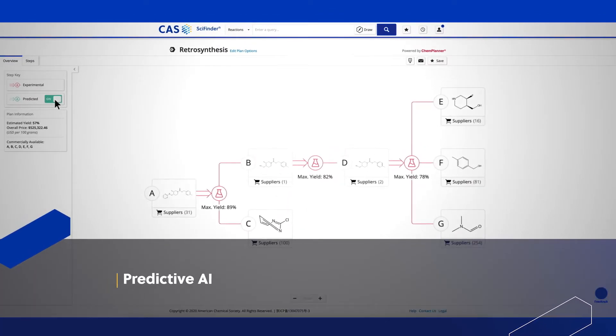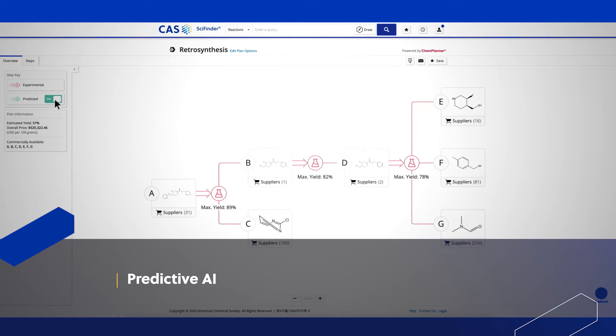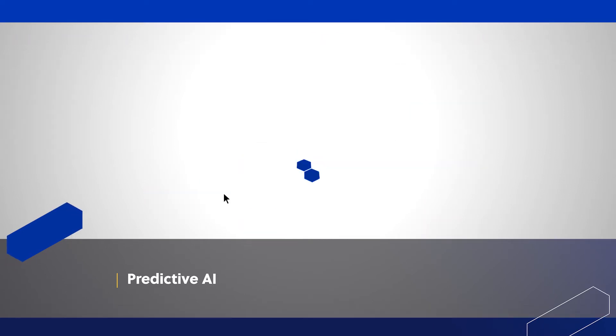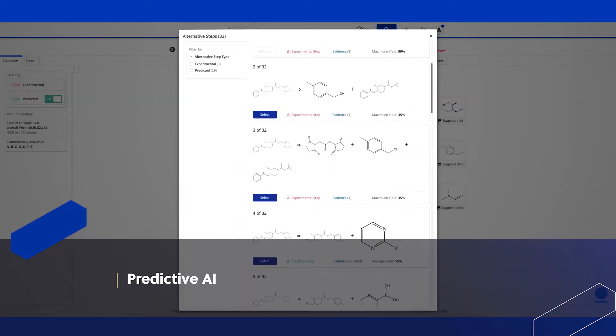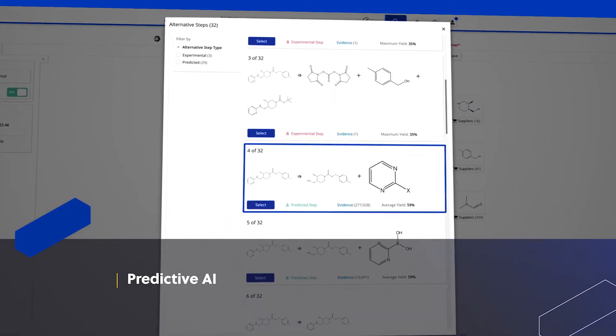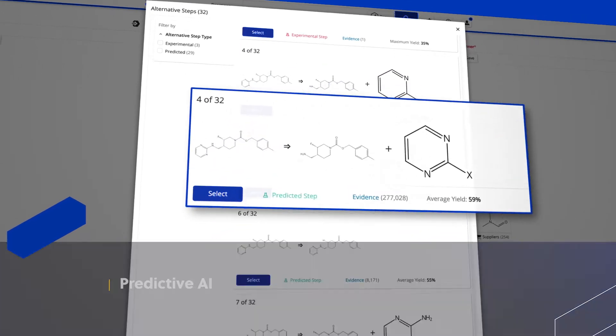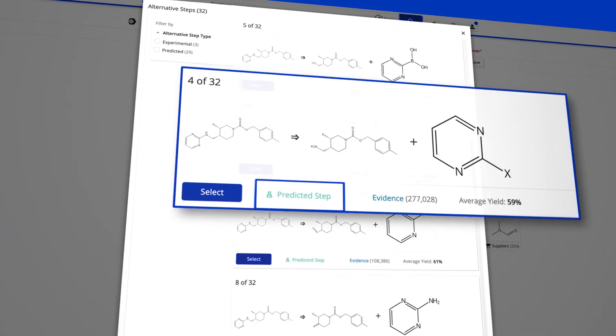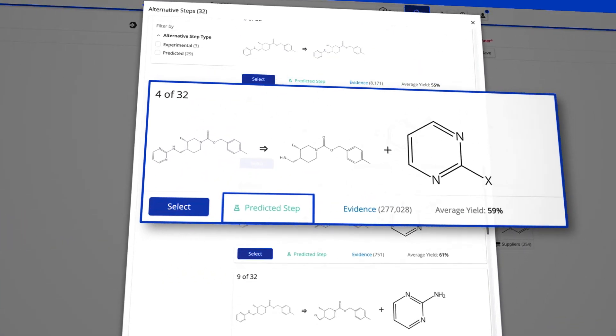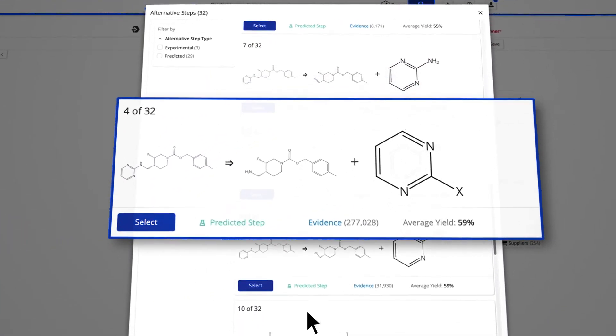SciFinder N goes beyond published experimental reactions and predicts novel reaction steps. That inspires new ideas to help solve synthetic challenges.